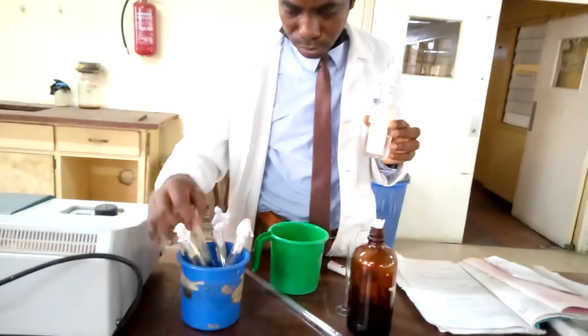Then the second tube, I label 0.4. I will need 0.8 mil of water to make my 0.2 mil of the amino acid up to 1 mil.